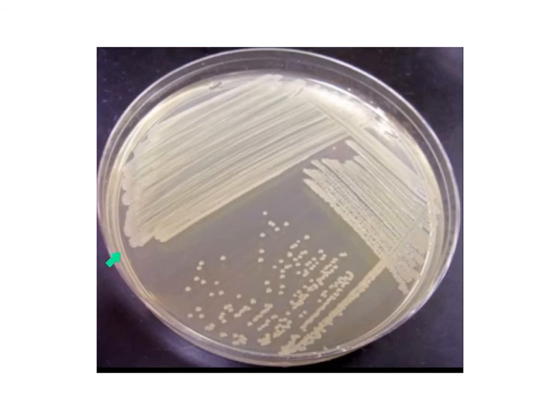Here we have a very nice, well-done plate streak where we see the heaviest bacteria in section one. We can see how it's thinned out here, and how finally we have lots of individual colonies that we can work with in order to run our various tests for identification.